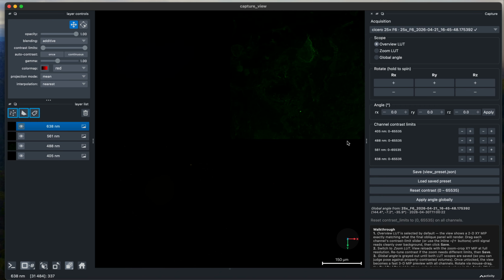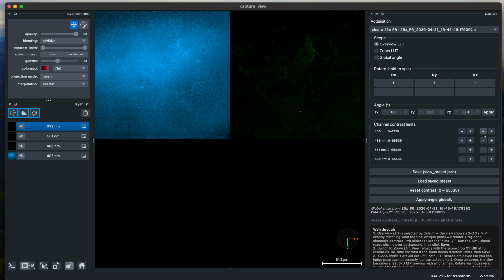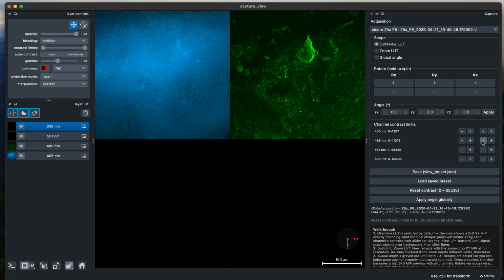Okay, yeah, so again, a 16-bit image, if I render that in 256 levels like I have to on a screen, typically what you're looking at is black. So instead of using these contrast tools here, I have the black level and the white level controls, and all I have to do is click and hold here, and this will start bringing up the contrast. It's the same thing those lookup tools are doing, but it's a lot faster and more convenient.